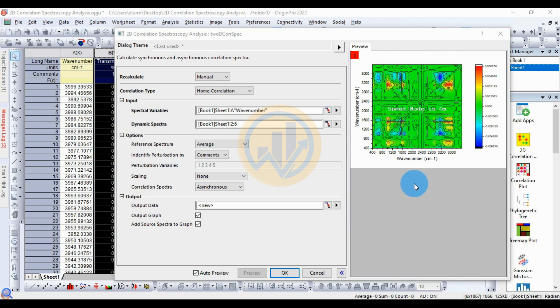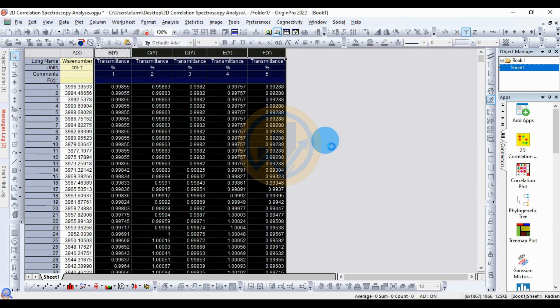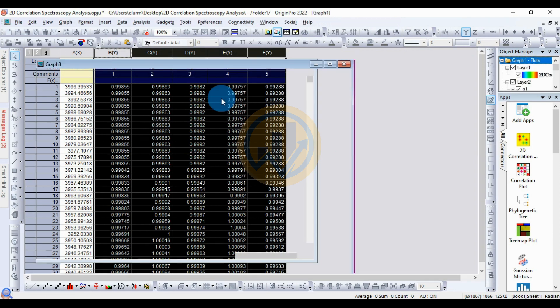Now view the auto preview of the 2D correlation spectroscopic plot in the right side corner. Then click the OK button to open the new tab with the plot.